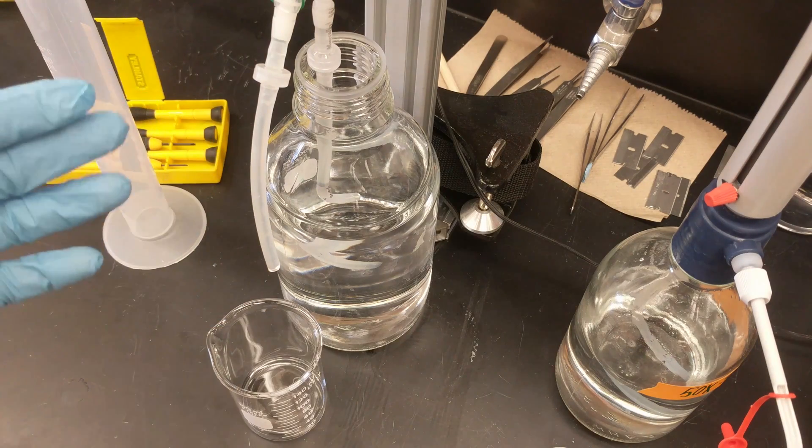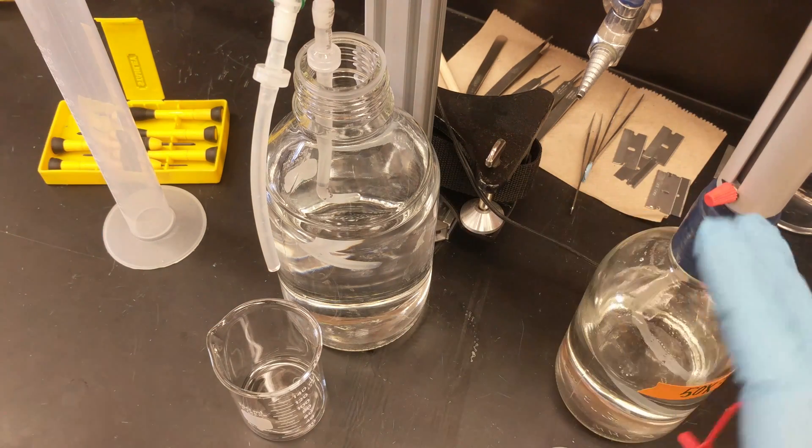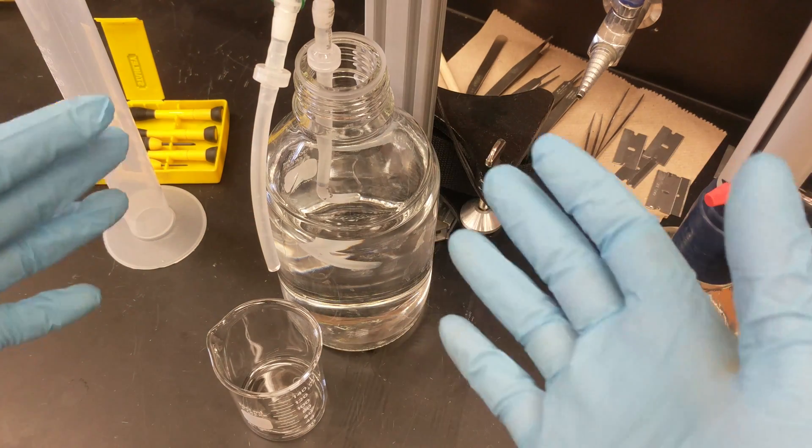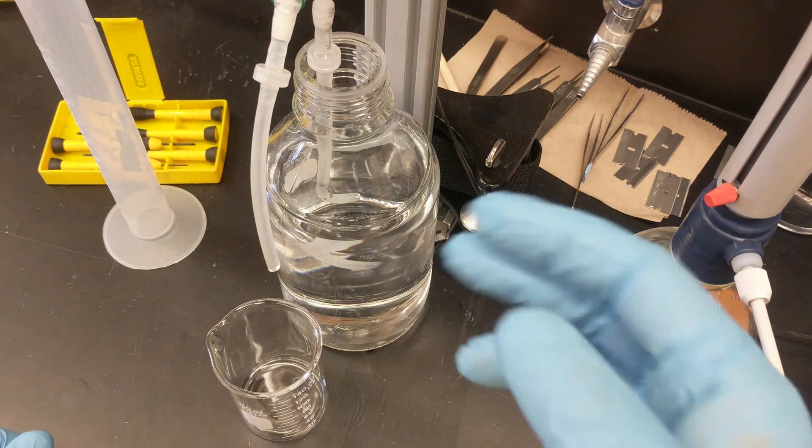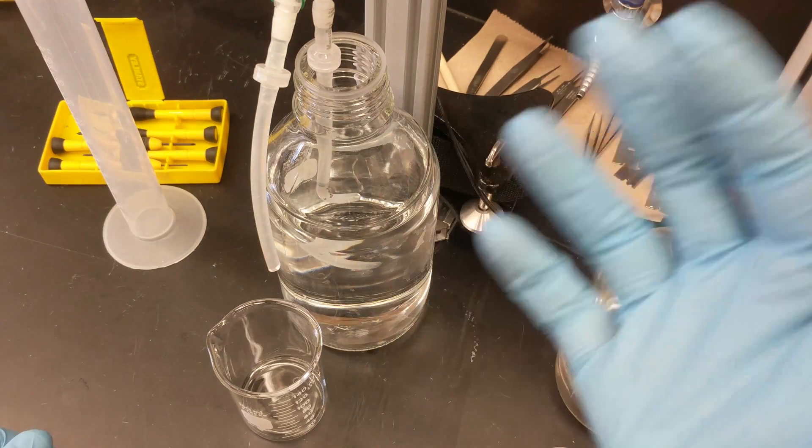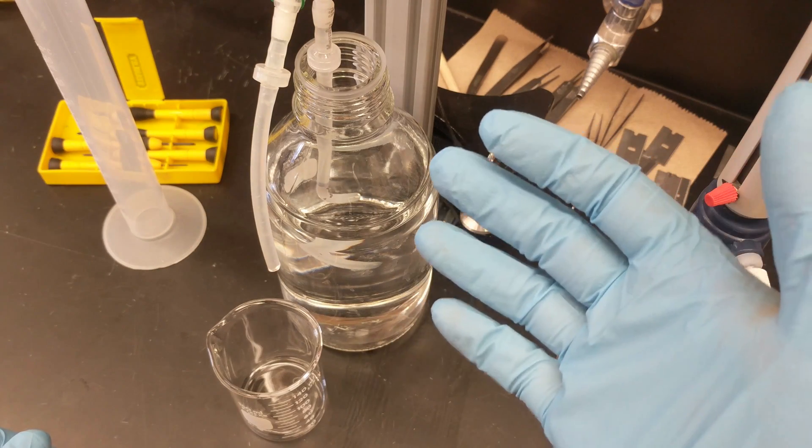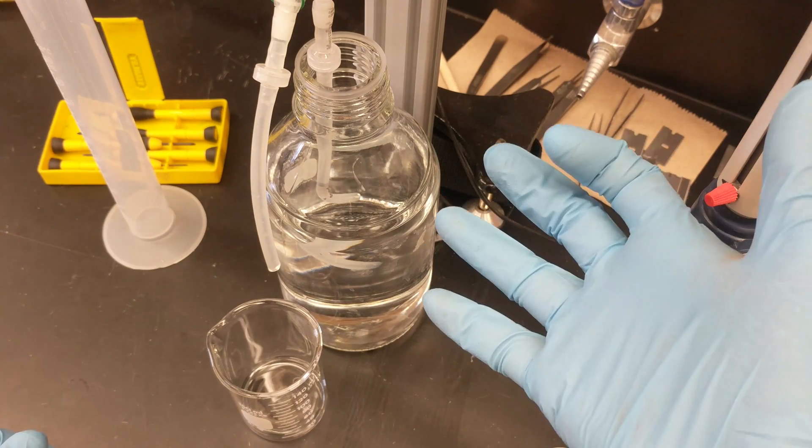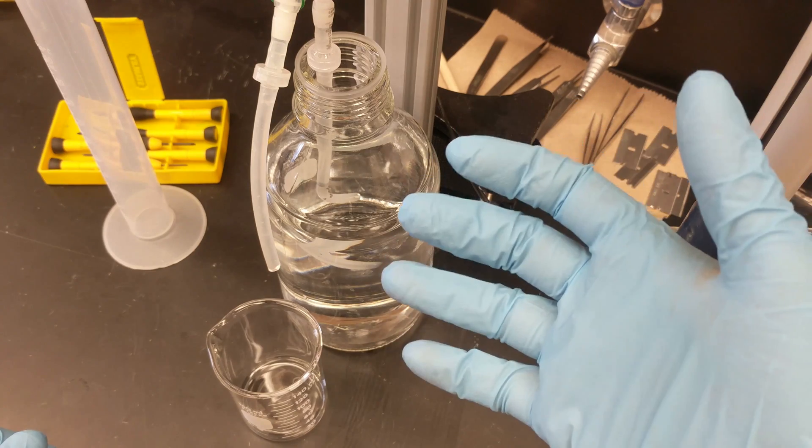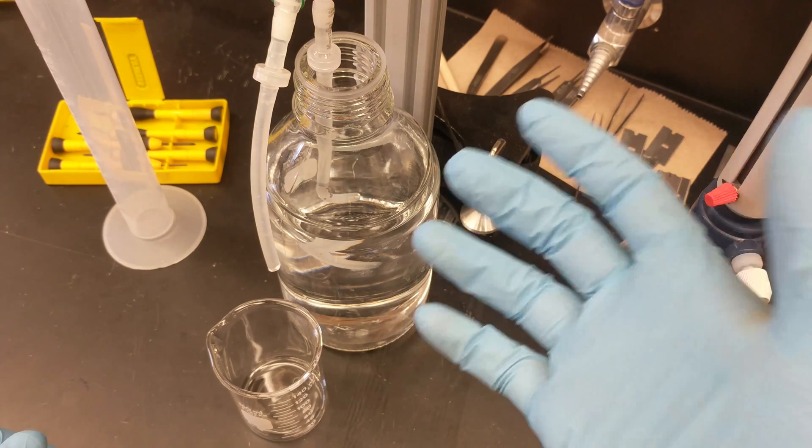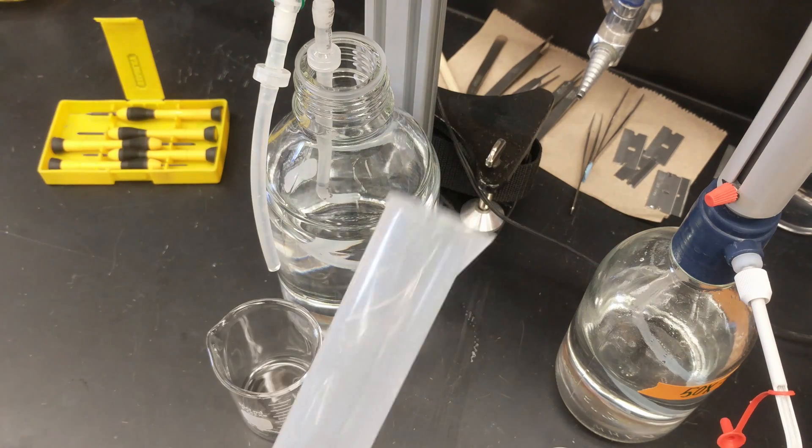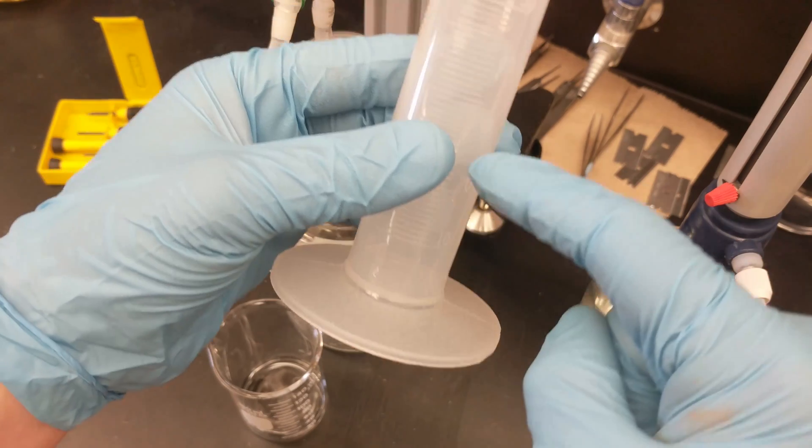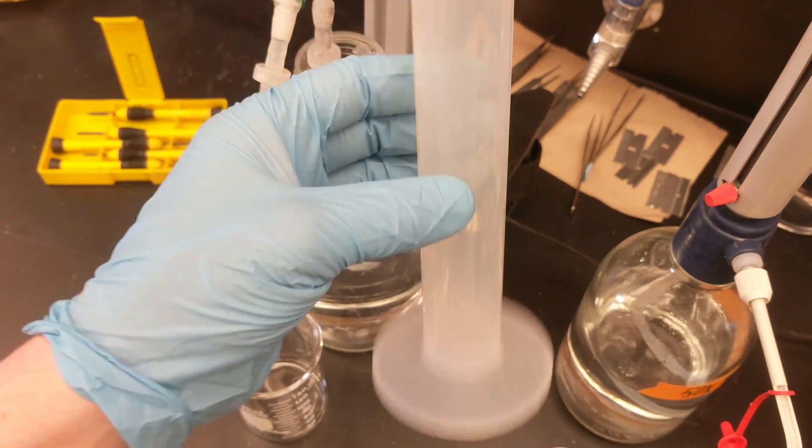So I've been going along my whole liquid dispensing theme for a while, and one thing that could be made more convenient in labs is dispensing buffers, dispensing aliquots of things in regular amounts without the hassle of taking out your pipette or getting a graduated cylinder and looking at the meniscus and all that kind of stuff.